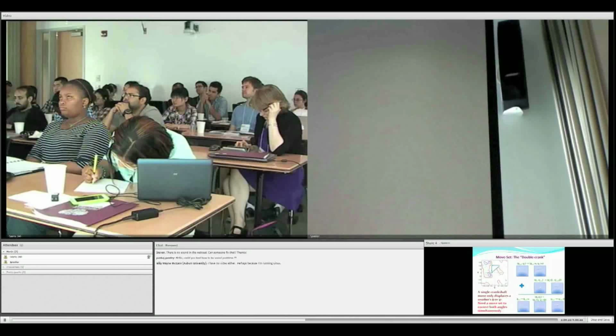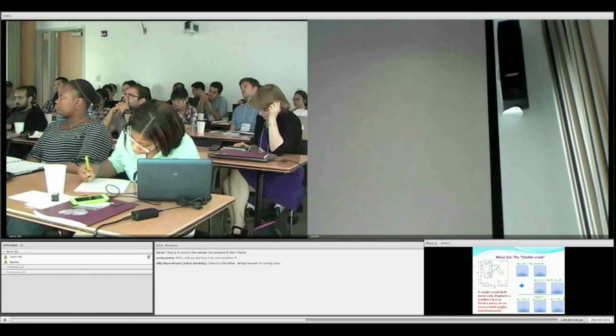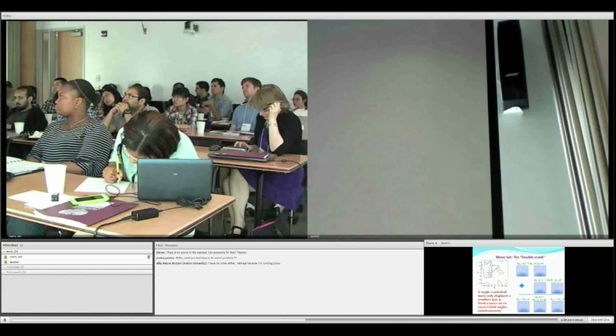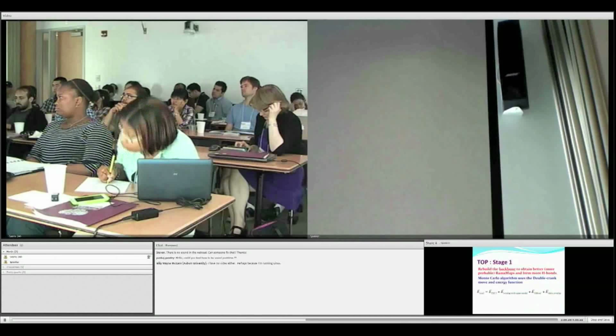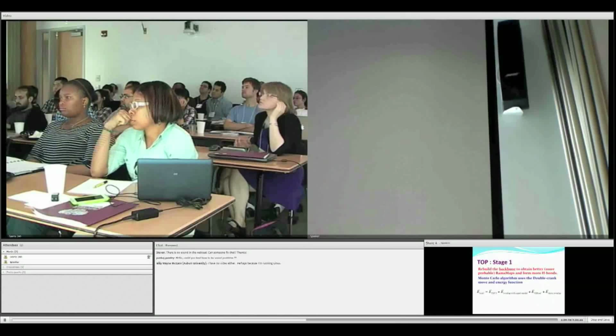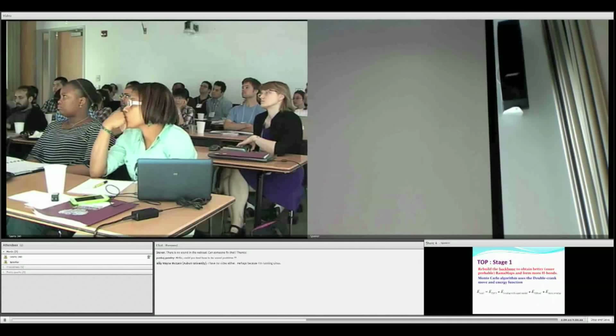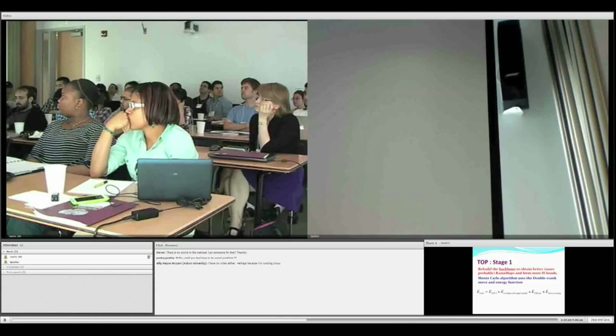So here, the idea is that I would like to go from here to here. I would first make a change in the phi space, this blue arrow here. Then I would make a change in the psi space for the neighbors, I plus 1 and I minus 1. And then if I add everything together, I would get this residue to move to the allowed regions of the Rama map by keeping the secondary structure intact as much as possible. So we have put this together.